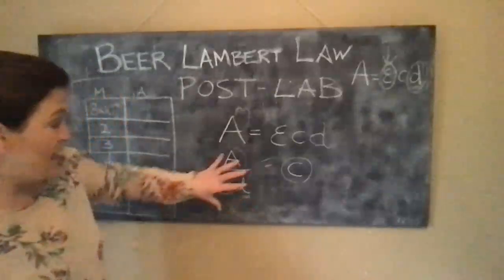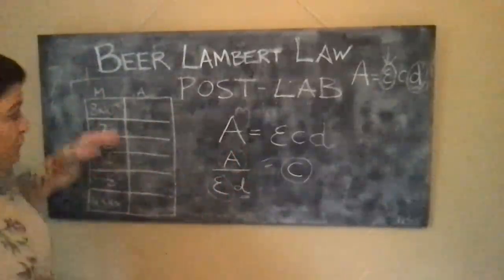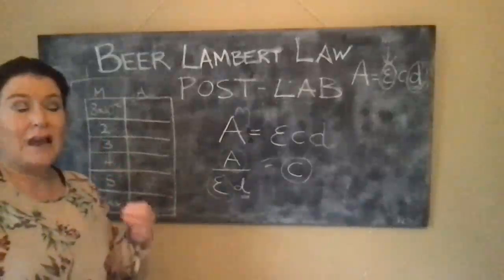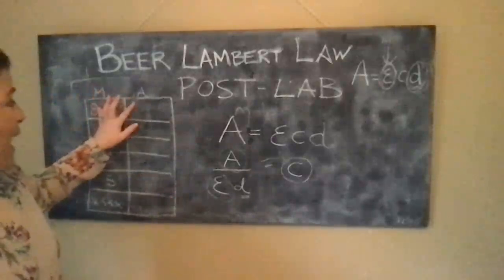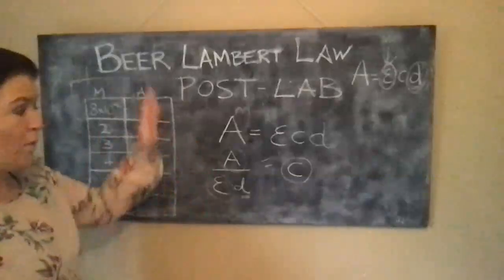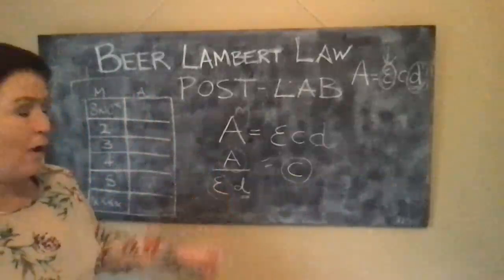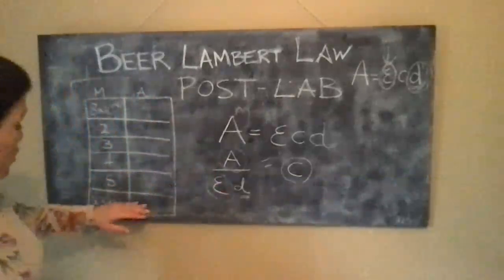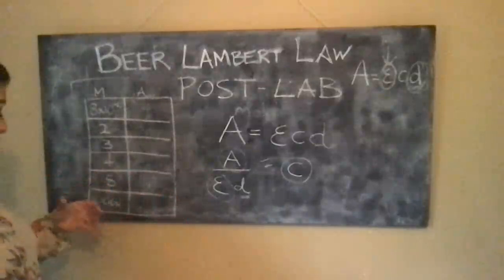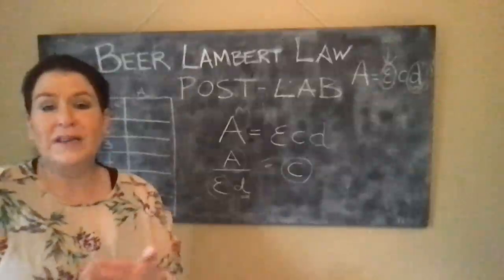And from then on, this is now a mathematical tool that you've created by taking serial dilution, creating a number of solutions, getting corresponding absorbance values at the lambda max wavelength, comparing how the concentration relates to absorbance by creating a linear graph, finding the slope of that line, epsilon. That is now the tool you've created to determine. So the overall aim in this experiment was to determine the unknown concentration of a known solution using the Beer-Lambert law.